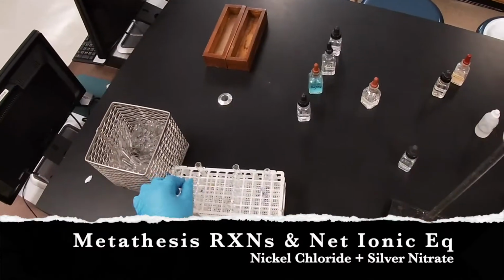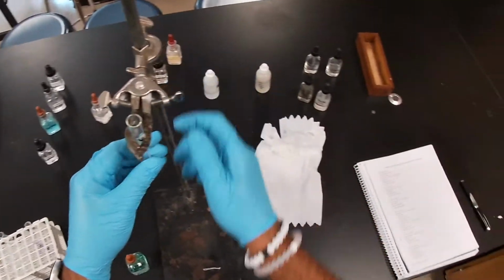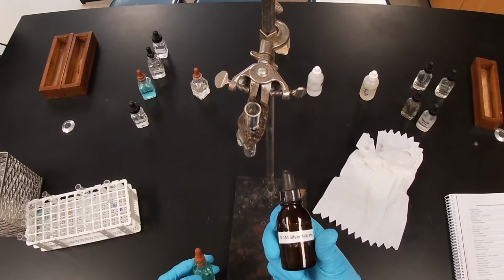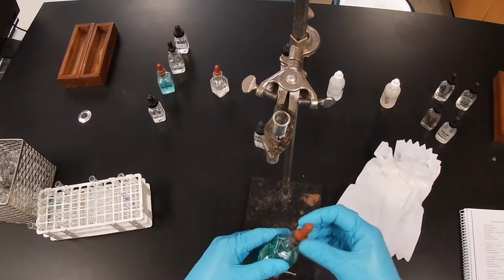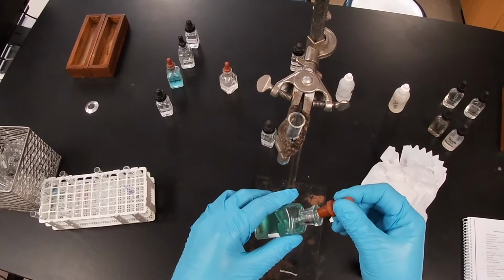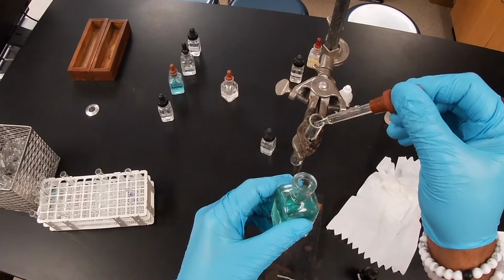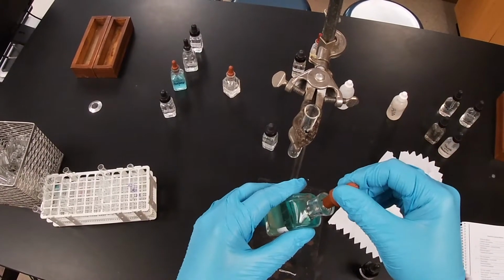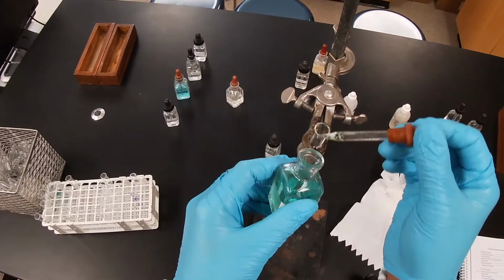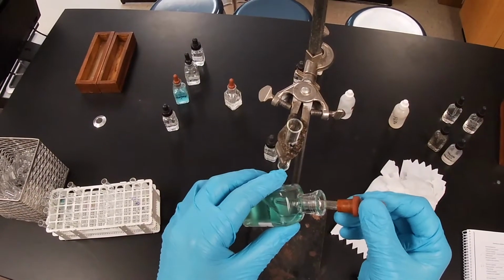Next reaction we're going to do is going to be between nickel chloride and silver nitrate. And so this will be reaction number 8. So here we have our nickel chloride. Here we have our silver nitrate. So we're going to go ahead and add our 2 solutions. It's not cooperating with me. Add a little bit more.